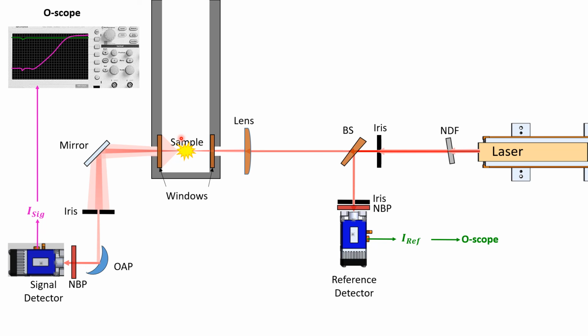Here is a good point to describe the remaining parts' functions. Notice that the reaction emits some scattered IR light that we don't want reaching our detector. The intensity of this light will vary based on the reaction, but it should be a minor but not insignificant fraction of the laser intensity. It is diffuse light, so it spreads out and becomes weaker as it progresses along the laser path. The majority is then filtered out spatially at the iris. Only a small fraction of what remains at the narrow bandpass filter will be in the wavelength passband, so most of what reaches the filter will be rejected here.